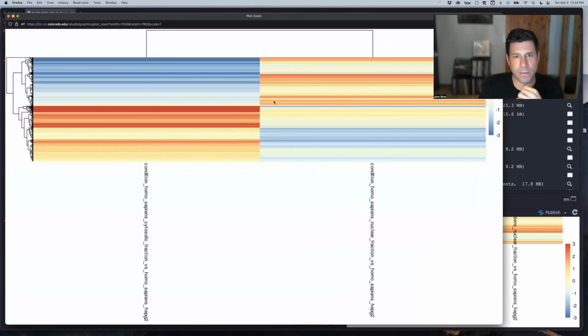So this is a different way, whereas before we were forced to find all the differences between the two of them. We're now looking at all the genes and saying, hey, are you enriched in cytoplasm versus total? And these red over here are enriched and these are depleted, whereas we see in nuclear, as we would have expected, that if you're depleted here, you would be enriched here. And so that's just a little bit different way of where we took all the results and compared them and made a data frame for all of our results, picked out these two conditions and compared them to total and not themselves.